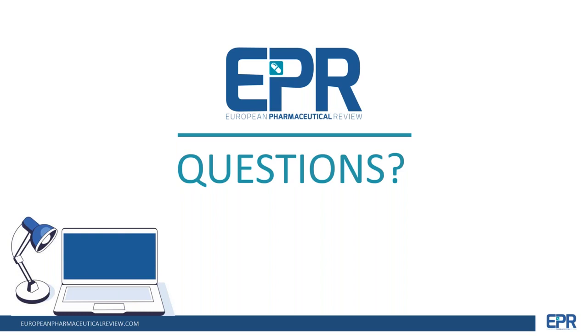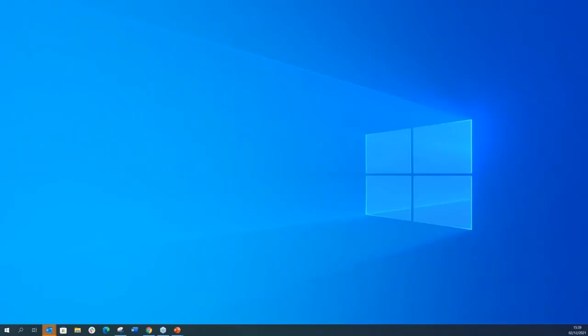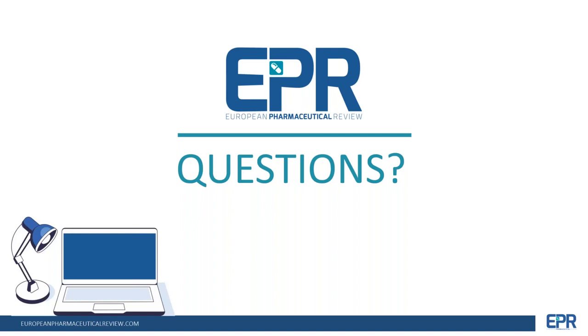Okay, good. Okay, another question. Somebody asks, can you resolve shortmers well? For instance, 9-mer N-1 from FLP 10-mer, or 19-mer from 20-mer? What would you say? Yeah, so that's sort of a repeat of a previous question, and the answer was, it depends. Not necessarily every time. It's easier on the shorter example, but because the separation is not fundamentally length-based, it depends. Great, thank you.